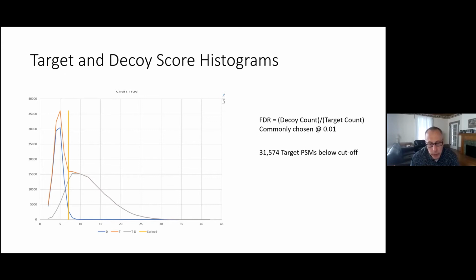Within a peptide list, we often have a column that says how many PSMs we saw of a particular peptide. But in the early days of DDA, it was really common to use PSM counts as a measure of abundance. As the field evolved towards intensity-based measurements, there are still some practitioners of that, but for the most part that's gone away. So is that answering your question?